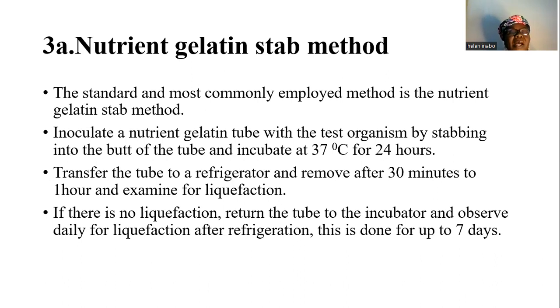After 24 hours, the nutrient gelatin tube is transferred to a refrigerator and removed after 30 minutes to 1 hour, and then examined for evidence of liquefaction.